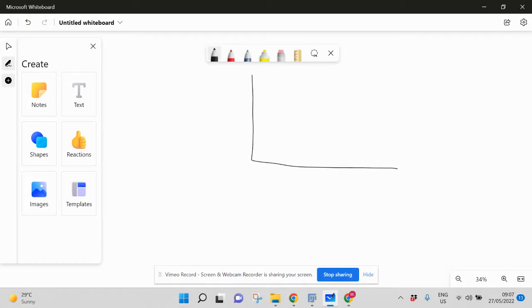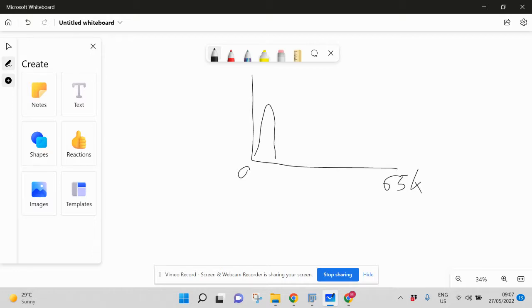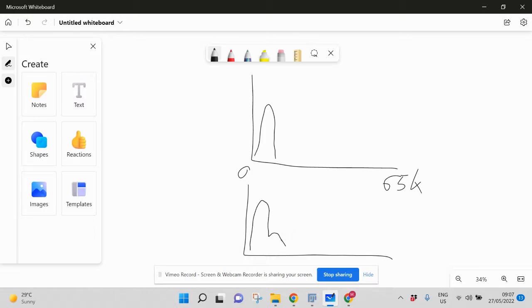The x-axis range represents the full 16-bit range, which goes from 0 to 65,535. Our cells at low intensity are in the low hundreds, so they sit very close to zero on this scale. The untagged strain would have a small peak near zero, and the YFP-tagged strain would have a similar background peak but with a small additional tail for the cells. I apologize for the sloppy graphics — this is meant to be a quick and dirty video.